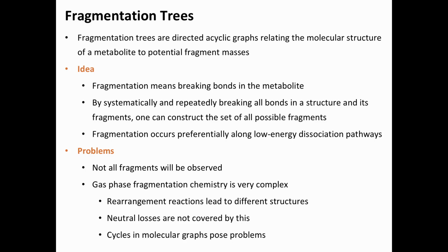Fragmentation is a stochastic process, but it strongly prefers low energy dissociation pathways. So you try to activate the bond, and the weakest link in this molecule will break. But of course, you can also activate higher ones. It's all a matter of energies, and that's where the collision energy comes in. At different collision energies, different bonds may break.